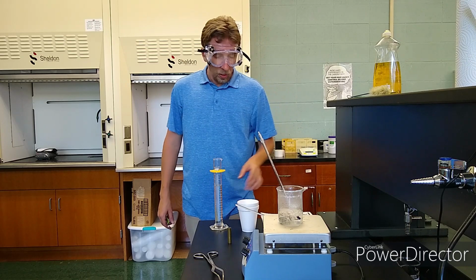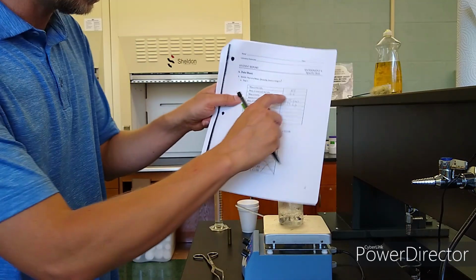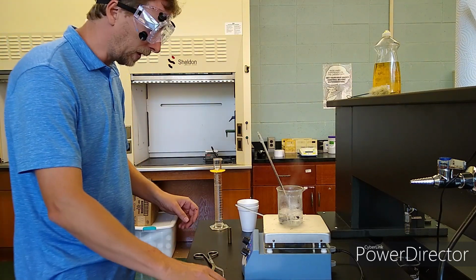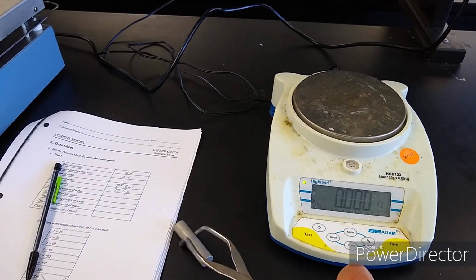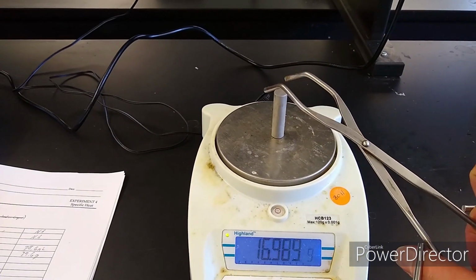So, next thing that we need is, well, I left out, we got to fill in the mass of the metal right here. So let me turn on my scale here and give you the mass of the metal. All right, here's the mass measurement. Should have done this before heating it up, but I took it out of the water so that we can measure the mass of it real quick.